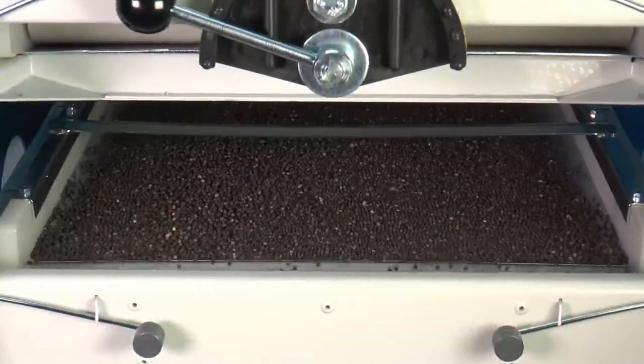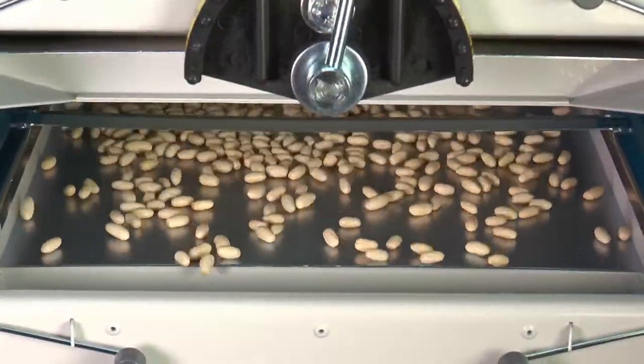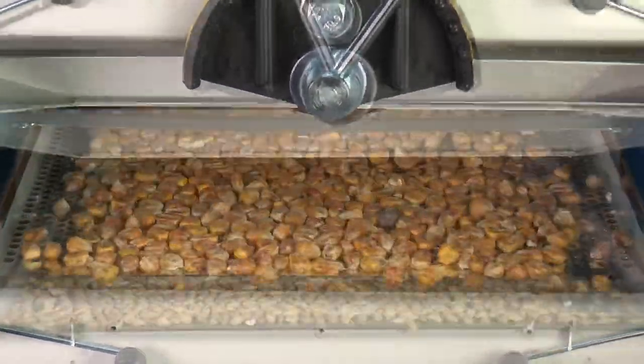The cleaner can be used for many kinds of products. A huge variety of different sieve sizes is available.